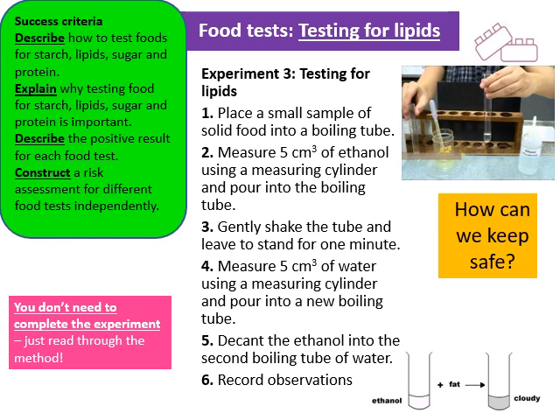Moving on again, this is the test for lipids. So this is the third food test we're going to look at. I'd like you to go through the method, make sure that you're happy with what we're going to be doing. If we were to do this practical, make note of some of the chemicals we might be using.